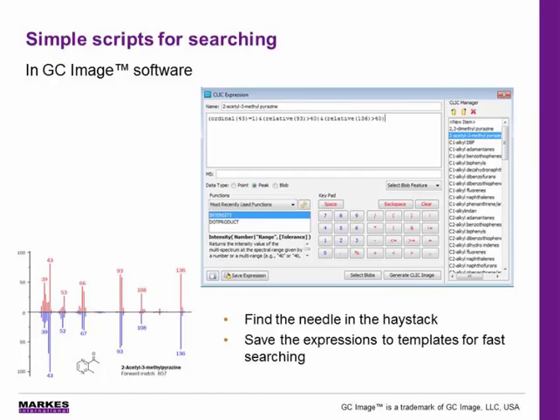To prevent needle-in-a-haystack type searches in these very complex data files, we use GC Image software to target key components. The software includes a simple scripting tool to search for target components based on their mass spectral or chromatographic features. For example, here we see the search expression used to find a pyrazine compound that is known to be responsible for a hazelnut aroma. The search was applied to the whole chromatogram and returned a hit in seconds, with the best match for this compound shown on the slide. These search expressions can be added to a template to make it quick and easy to search for target compounds across multiple samples, even when your chromatograms contain thousands of peaks.